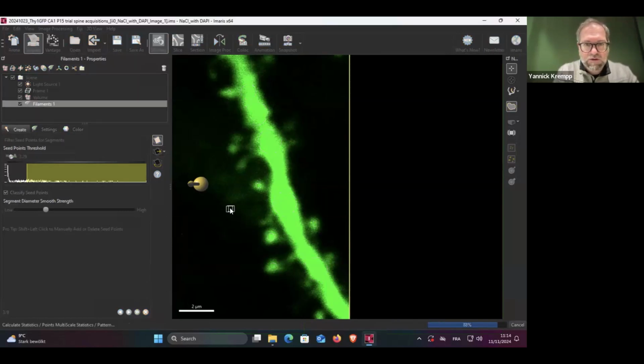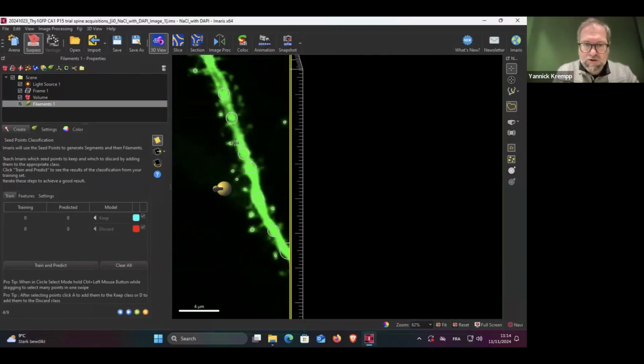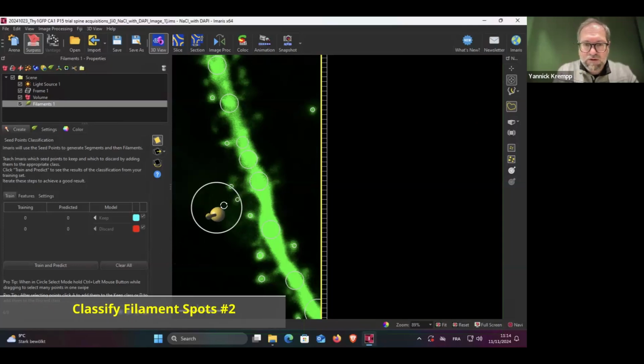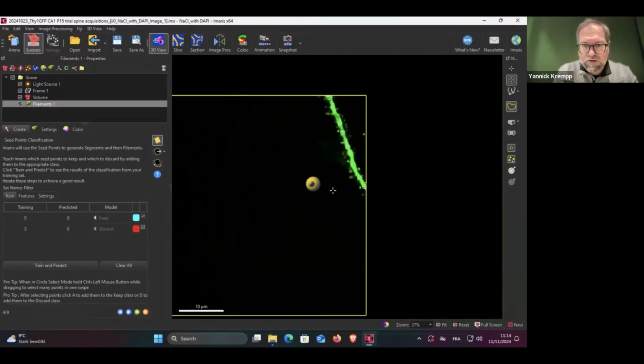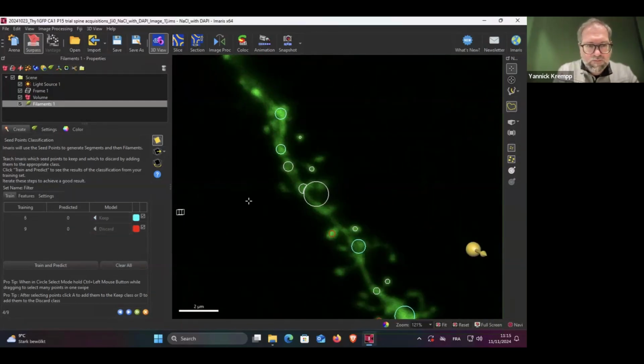Okay, and let's go back to our training. So did we lose the training? Yeah, of course, since we changed the detection. So anyway, let's try again. I try to go a bit faster here. So we have now a few examples.